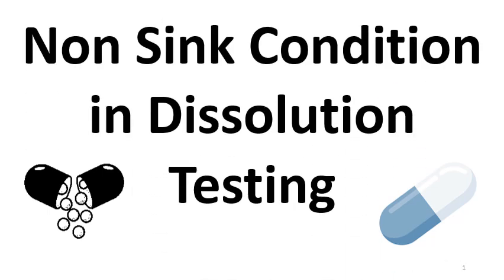Hello and welcome, dear viewers, to another interesting topic on dissolution testing, and the topic is non-sink condition in dissolution testing. So you might have heard regarding the sink condition and non-sink condition. Always the sink condition is used for dissolution testing, and there are advantages of sink conditions.